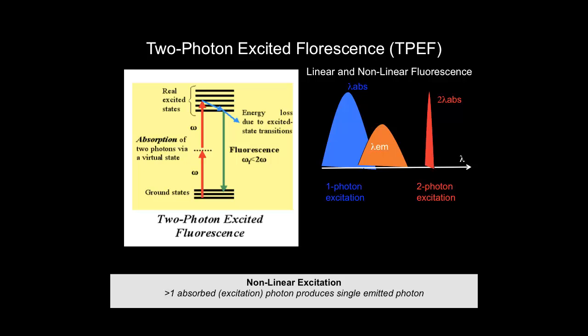Not most of them, I would say. Again, that's another discussion we would have on selection rules, and what makes some molecules excited by one photon and not by two photon. But most of the ones we use, you can excite with both.